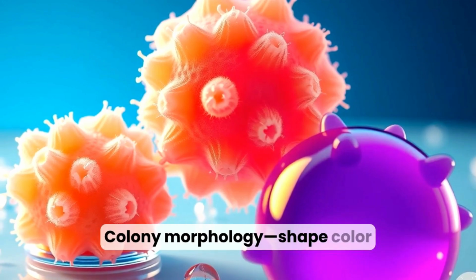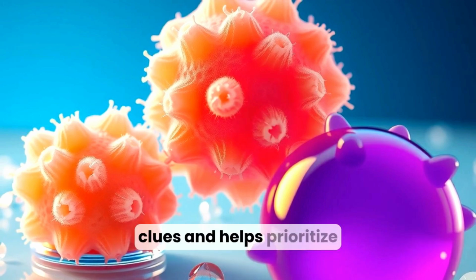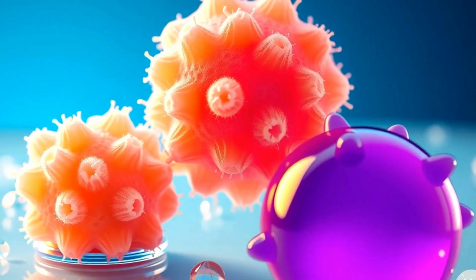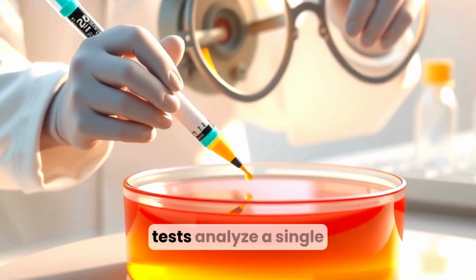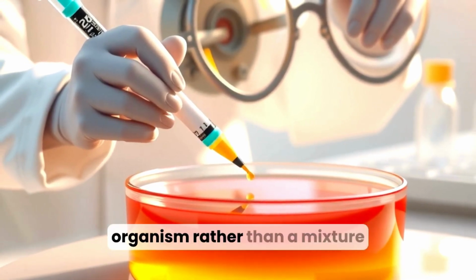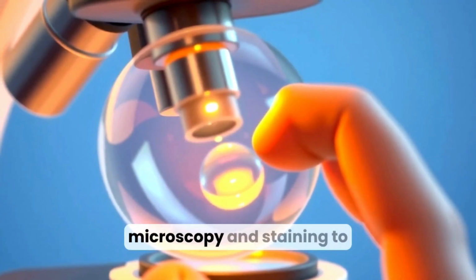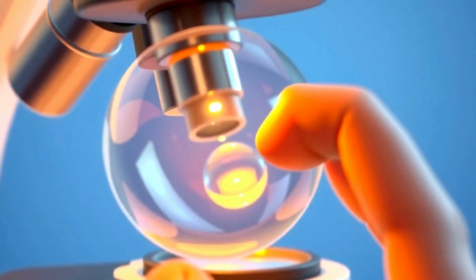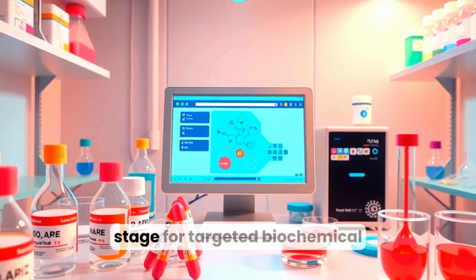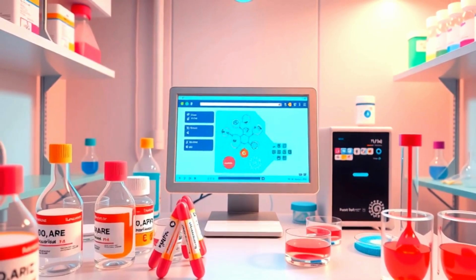Colony morphology, shape, color, edge, and texture, gives initial clues and helps prioritize further testing. A pure colony is then subcultured so that subsequent tests analyze a single organism rather than a mixture. Once isolated, we move to microscopy and staining to learn about cell shape and structural features. These basic lab steps set the stage for targeted biochemical and molecular tests that confirm identity.